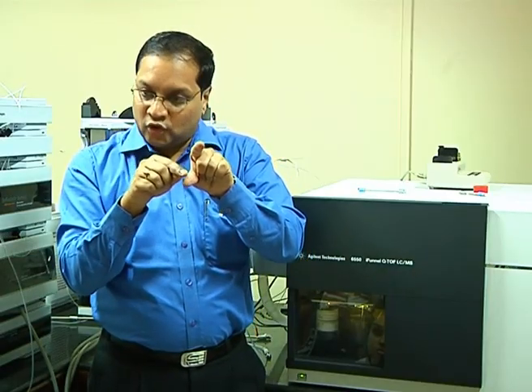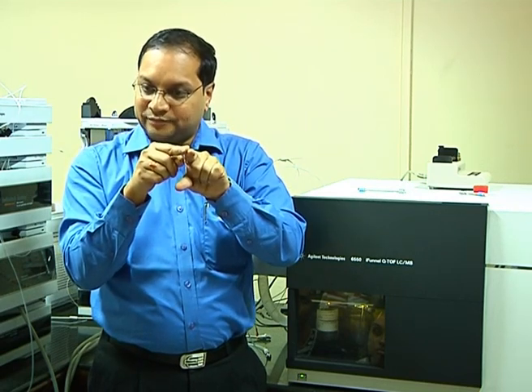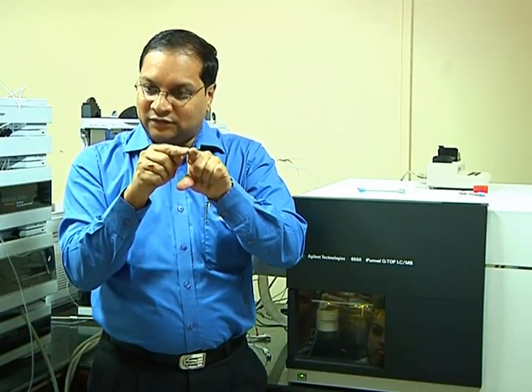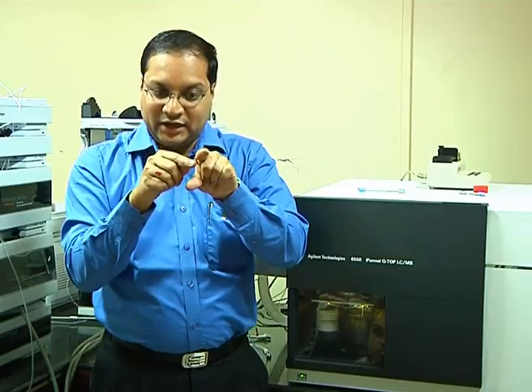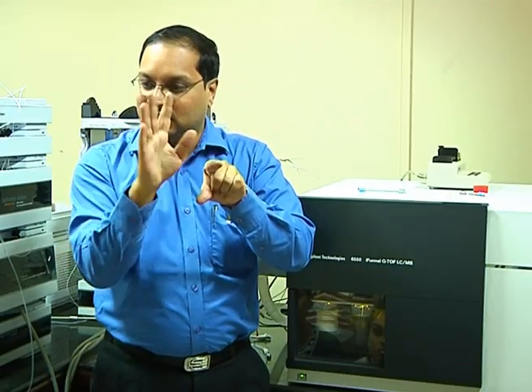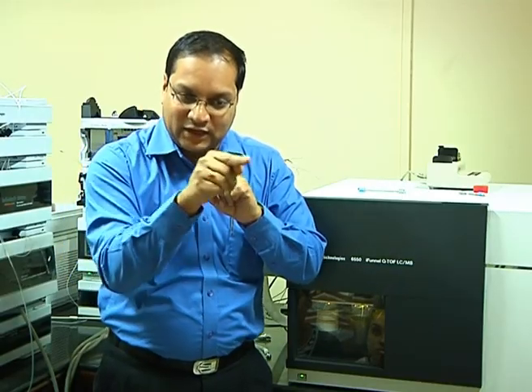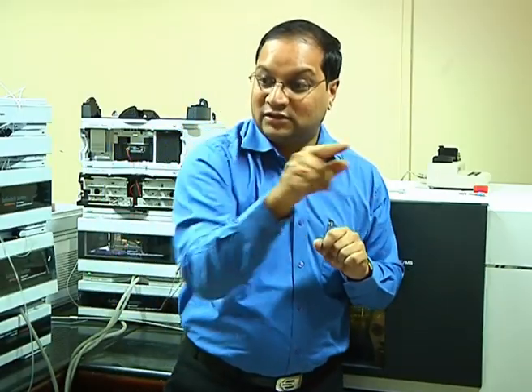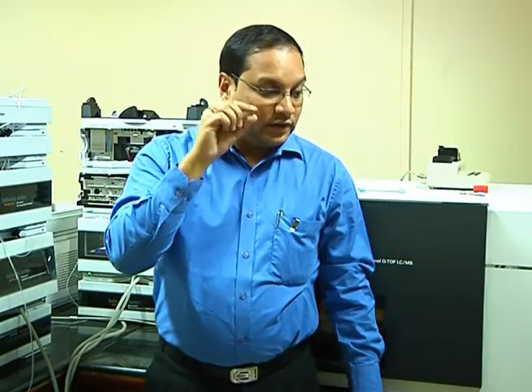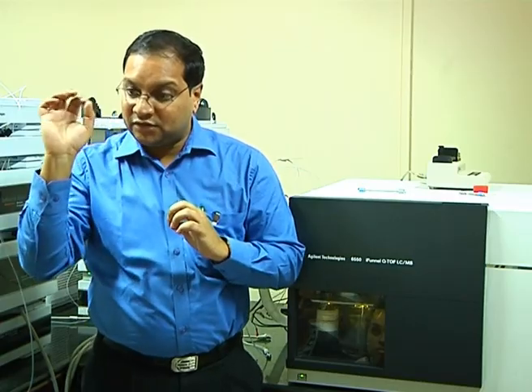So the moment it comes close, the polarity switches. This becomes DC, this becomes RF. So now, instead of attracting, this will repel 500, and this will attract. So it will travel like this. During this, probably the other 5,000 will get hit here and get lost. Then again the polarity switches, and it comes here. Like that, it will try to travel through the quadrupole selectively, and the other 10,000 will hit somewhere or other and get lost. In this way, we can filter mass with very high specificity.